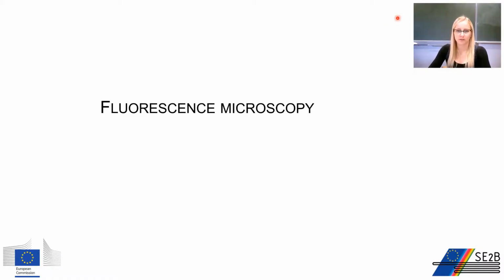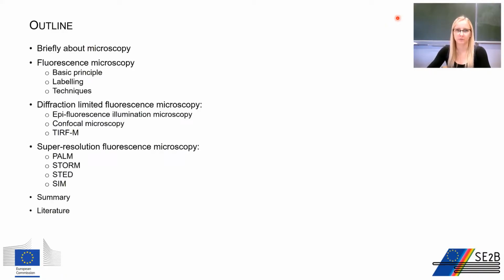In this lecture you will learn about fluorescence microscopy, more precisely about microscopy in general, then basics about fluorescence microscopy, labeling, and the division of fluorescence microscopy techniques. We will take a look at a few examples of diffraction-limited fluorescence microscopy methods and at a few super-resolution imaging methods.